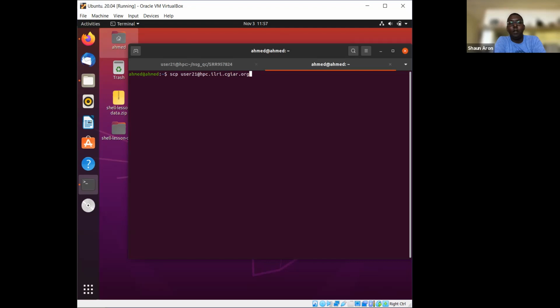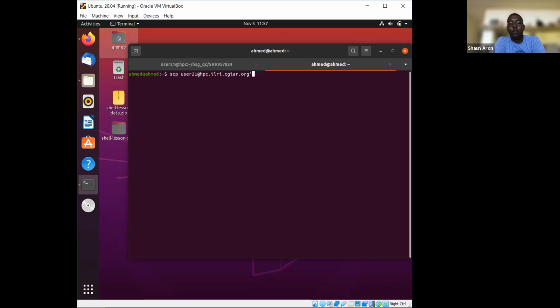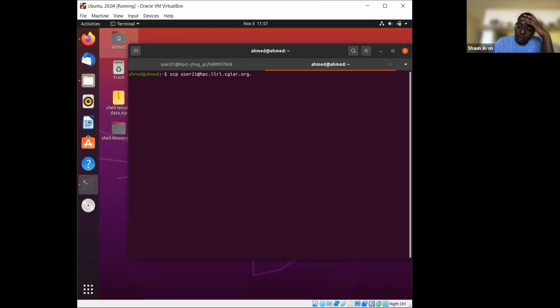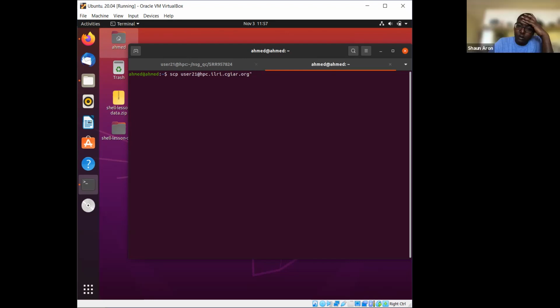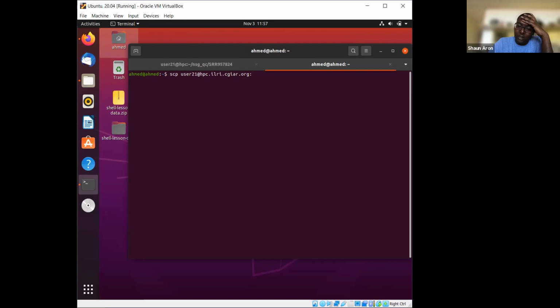No, go back. After org, just a colon with two dots. Not the dot, the two dots, the colon. It's not the same as the semicolon. It's the colon. Yeah, this one, that's the one.